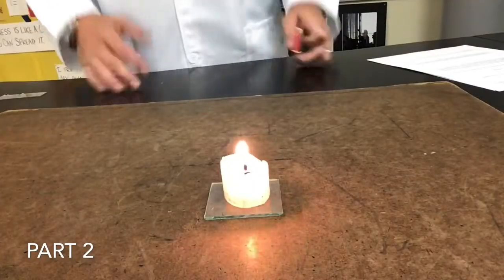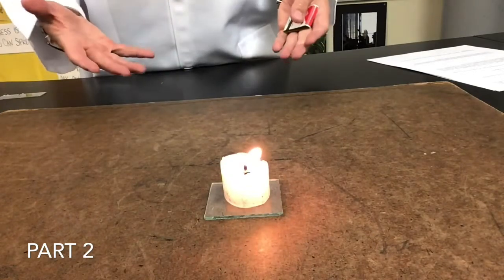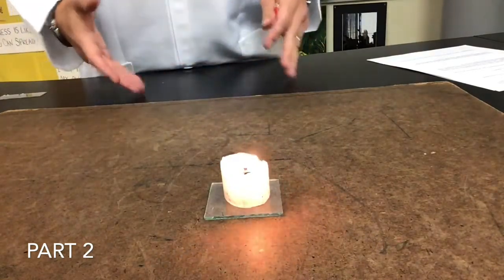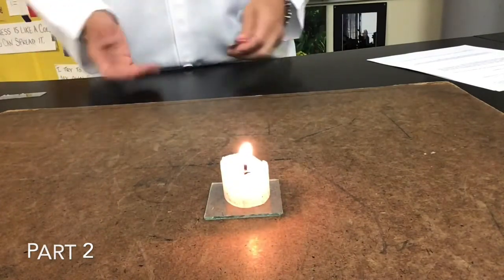Now that you've written down your observations for part 2, remember, the goal of this lab is for our observations to be clear. So make sure you're writing legibly and with details that everyone would understand. It would mean the same to them.